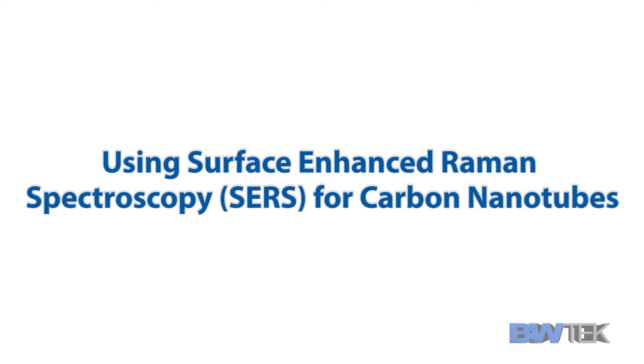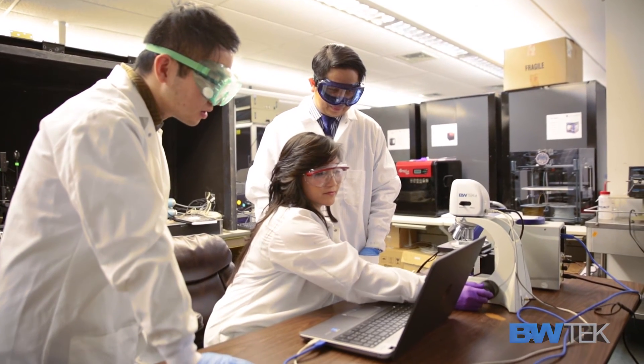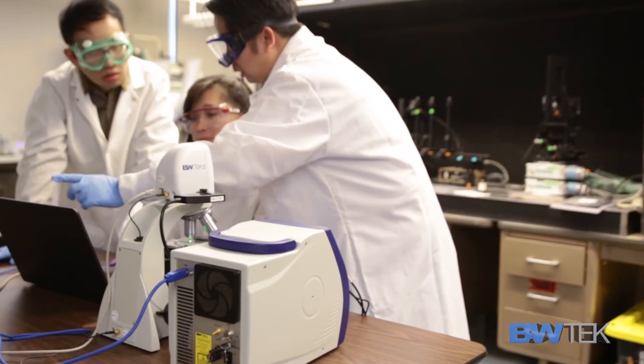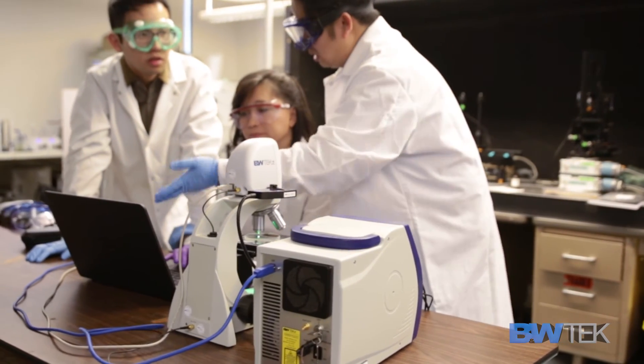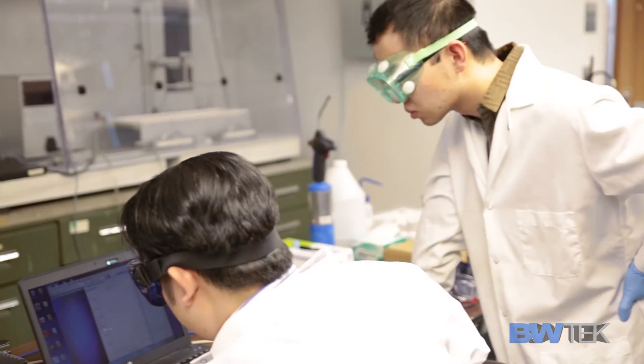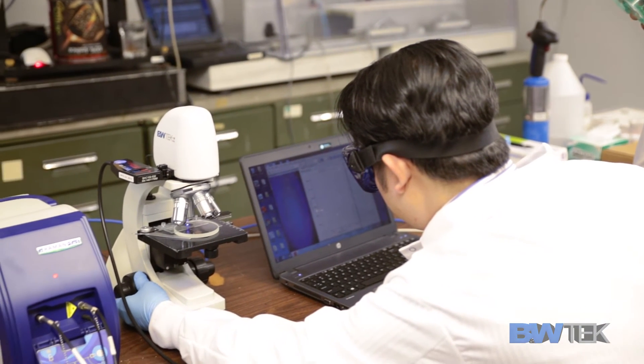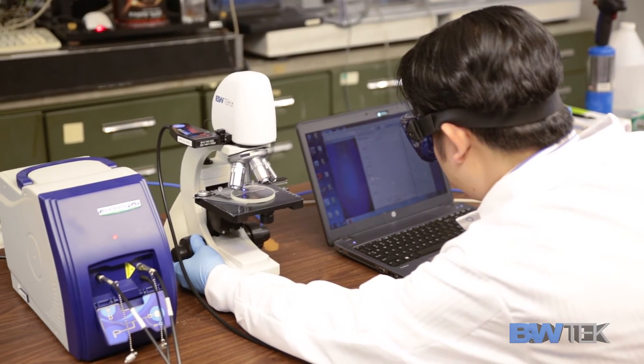The microscope setup and spectral analysis are almost intertwined. With sample analysis of various types of morphology or location, the microscope allows you to pinpoint or look exactly at regions of high interest, especially with patterned substrates or samples that have various morphologies. By using the microscope option, one can do a simple click-spectra type of high throughput screening — move your sample to various locations, focus the instrument, and obtain your spectra. It's as simple as that.